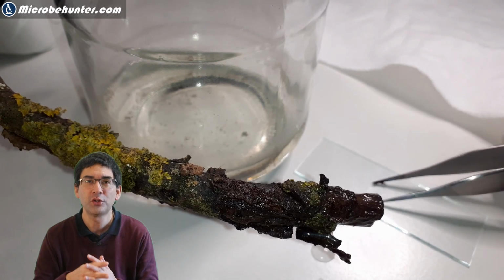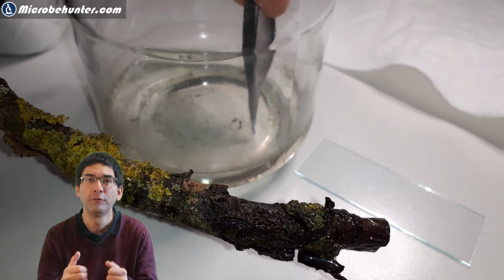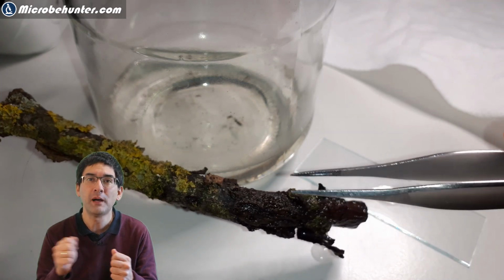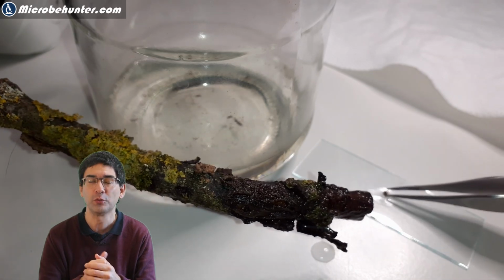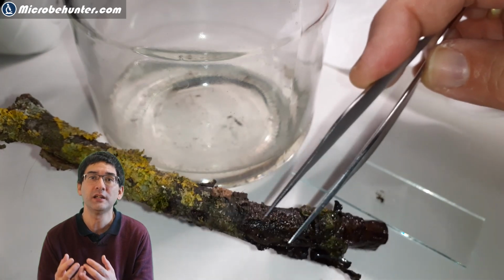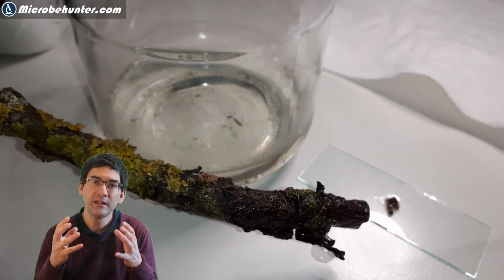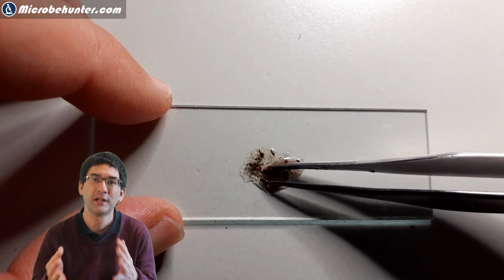And of course you also want to add a little bit of water, because what you want to do is you want to wash the amoeba off from the wood. So generously scratch off some of the material and then try to wash them off by mixing it with a drop of water directly on your microscope slide. Of course there will be a lot of wood pieces and other debris and other material on the slide, and what you have to do then is after you've mixed it is to carefully remove this, and then the amoeba and other cells will be still in the water drop and you can observe it.